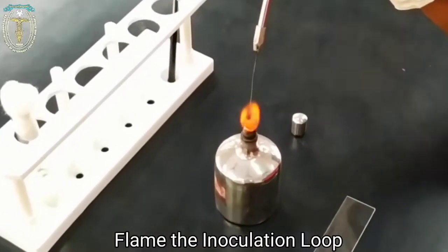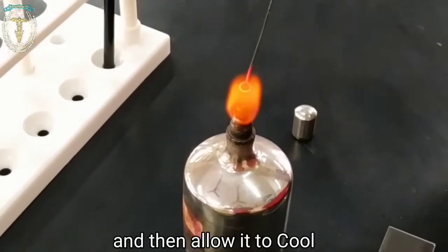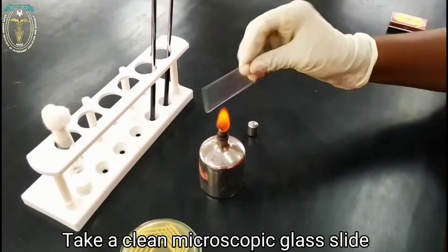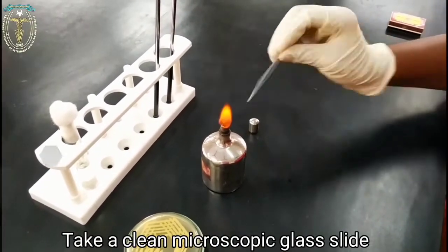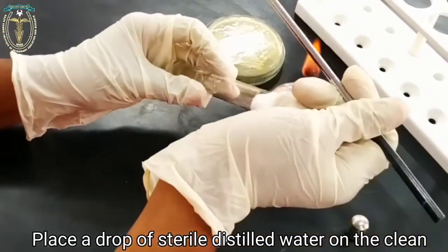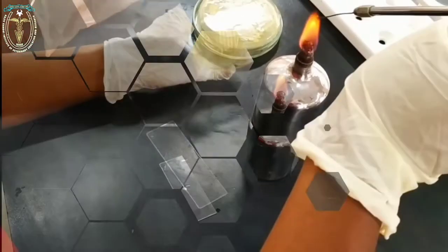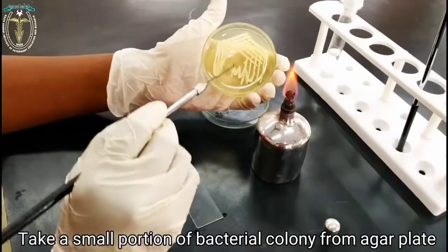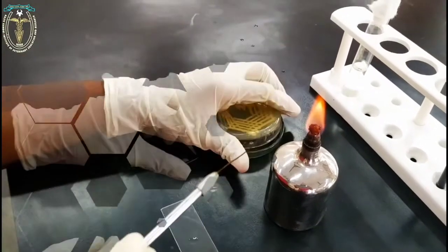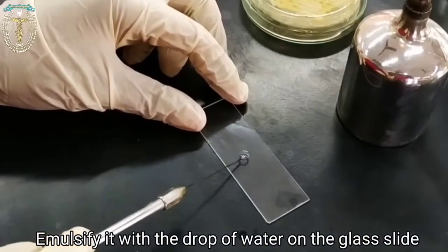Flame the inoculation loop to red heat. And then, allow it to cool. Take a clean, microscopic glass slide. Place a drop of sterile distilled water on the clean glass slide with the help of the inoculation loop. Take a small portion of the bacterial colony from the bacterial culture plate and emulsify it with the drop of water on the glass slide.